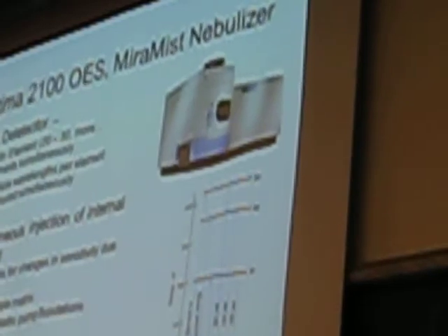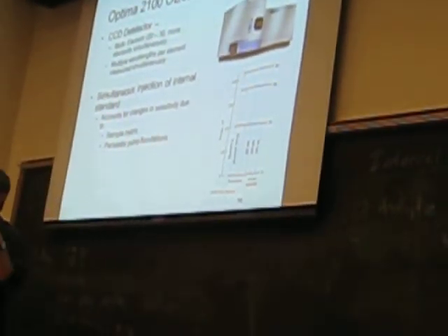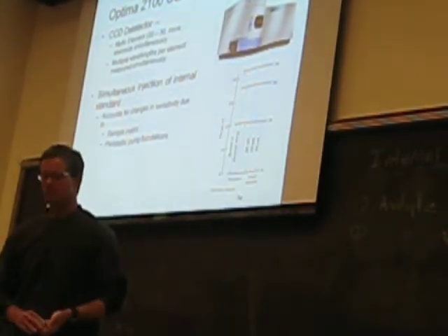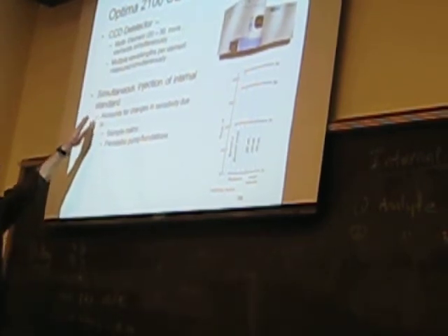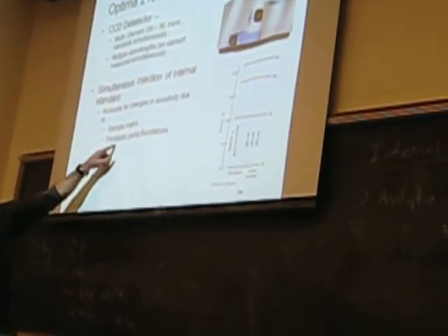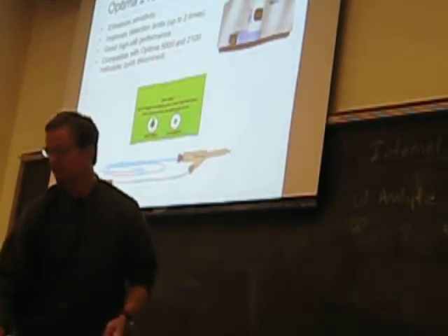So in principle, you are getting a more accurate representation of what the analyte concentration is because each emission line sometimes will have their own characteristics and some susceptibility to peak broadening and interferences. And you can measure multiple ones for each element to help combat that, right? You have the simultaneous injection of internal standard, I just talked about that, right? And so it helps account for changes in sample matrix. We just talked about that. And changes in fluctuation. Essentially, it's how important that is, right?